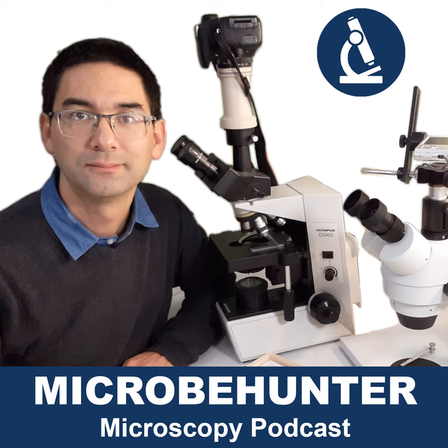It's going to be a much faster method of finding the focus than just trying it by random, by trial and error, and by spinning the fine focus knob into one direction 15 times, and then you cannot find the focus, so you spin it back again, and then you turn it into the other direction 15 times. No. It's not a good idea.